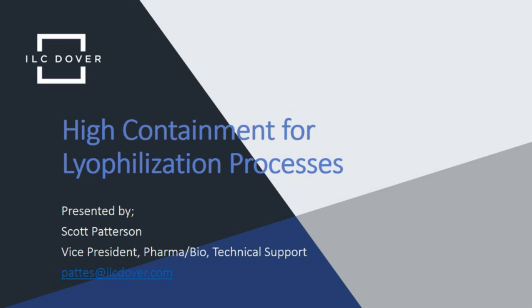Thank you, Kyle. Again, welcome everyone today to our webinar. Our webinar today is High Containment for Lyophilization Processes. We're going to focus on the use of single-use isolation technology for the high containment purpose.